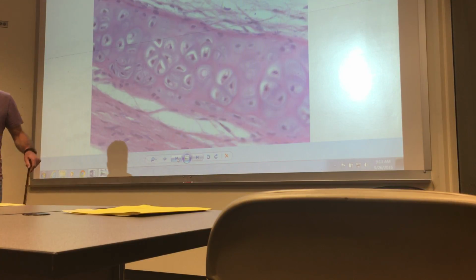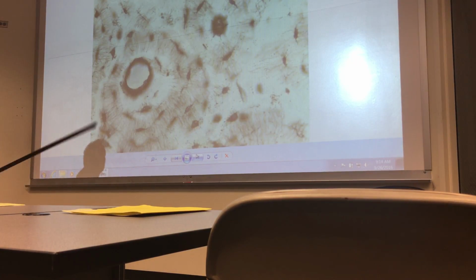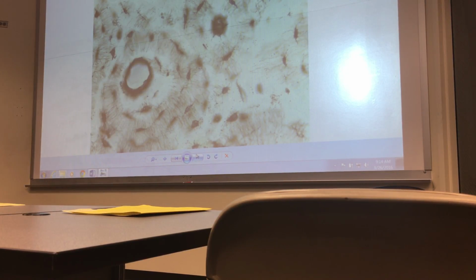Chondrocytes. And then the last one where you can do that. What types of cells are in here? Osteoblasts or osteocytes.